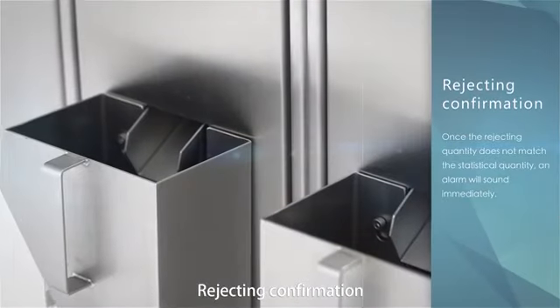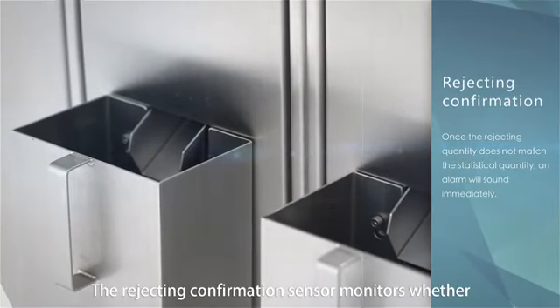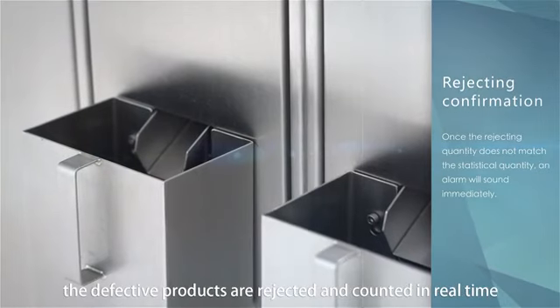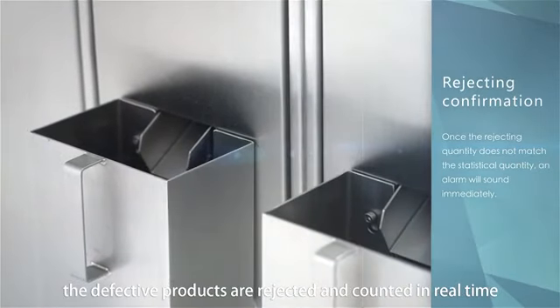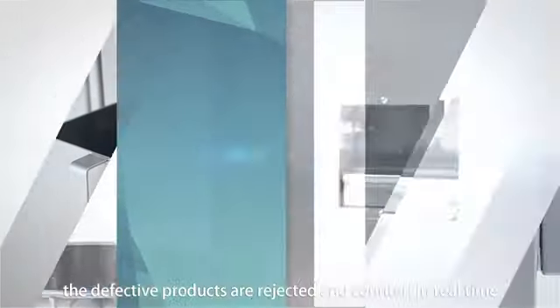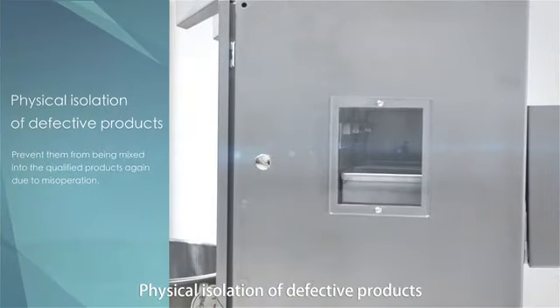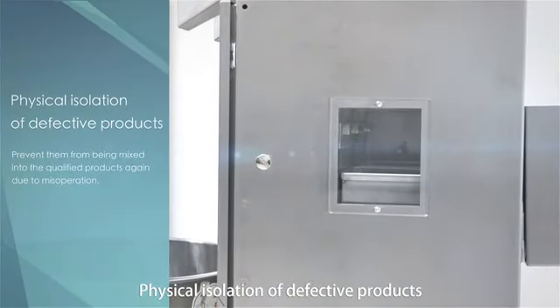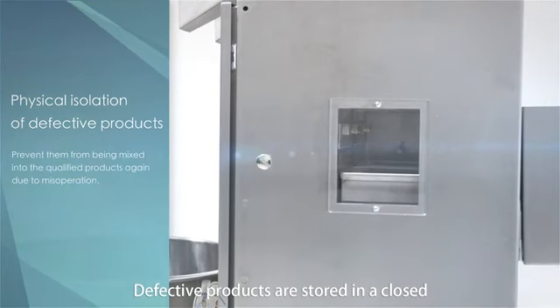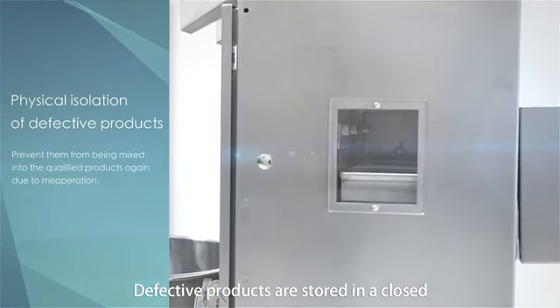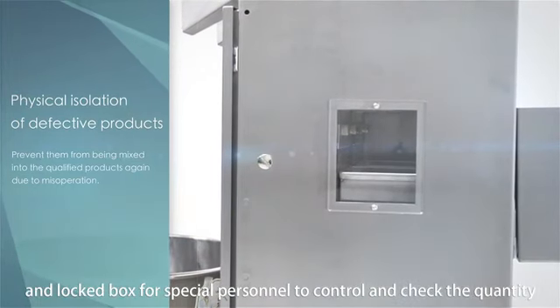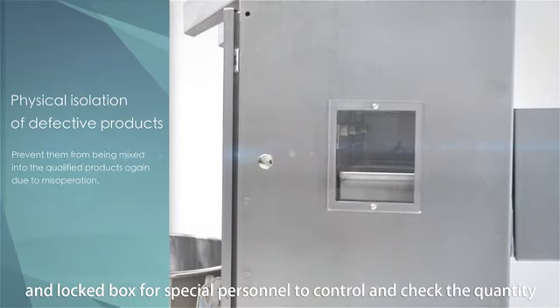Rejecting Confirmation. The rejecting confirmation sensor monitors whether the defective products are rejected and counted in real-time. Physical Isolation of Defective Products. Defective products are stored in a closed and locked box for special personnel to control and check the quantity.